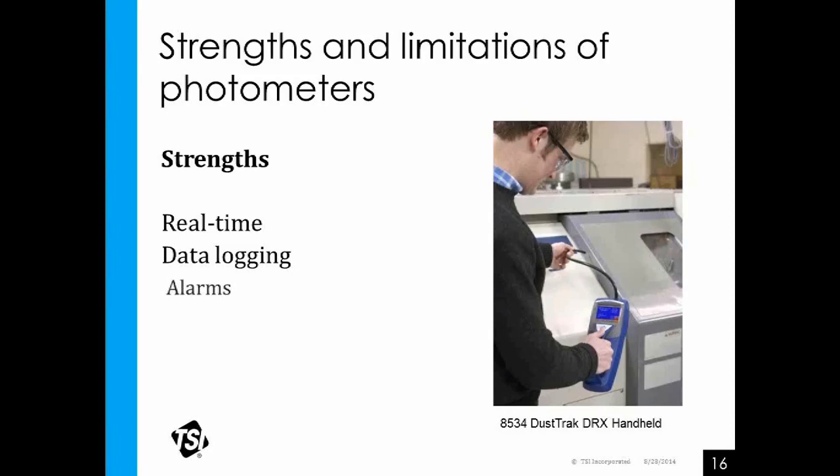So stepping back to gravimetric sampling, typical sample pump, there's a cassette to take an aerosol sample, some kind of particulate you clip in the worker's breathing zone. You're going to calibrate the pump, put it at a known flow rate. It's going to measure for 8 hours. Goes into the lab, gets sent back. You look at the result, and you get a number, your total mass collected of the aerosol. Now, the lab can also tell you what is in that sample. Is it lead, or is it chrome, or is it some kind of heavy metal, or some kind of other material? But really, what we're looking at is the mass.